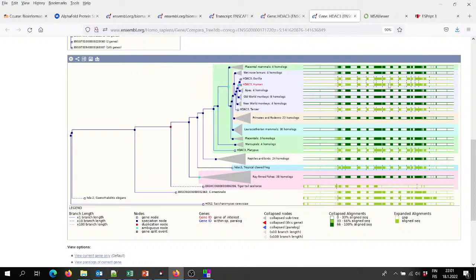Seeing these exon boundaries at the region of these white parts makes us think that maybe the alignment was actually showing some introns that have an open reading frame which shouldn't have been predicted there, but I'm digressing. And then when we have these triangles, they indicate that we have a compressed part of the tree.